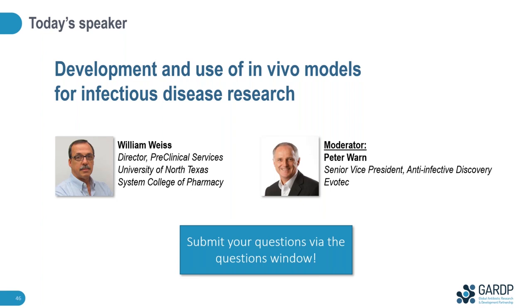In terms of handling the data, if you did both thighs, I've seen other people do one organism in one thigh and a totally different organism in the other. I don't think it adds anything to the data. I would rather it be the individual animal for each. How you would handle the data, most times I see people just say, this is the N, and do your means and do your analysis from that.